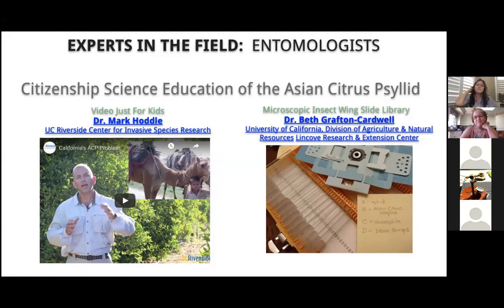I found the Foldscope by accident because I was looking for pictures of insect wings. I was writing some curriculum about the Asian citrus psyllid for a project I was working on a few years ago. And I came across the Foldscope website because people had posted various insect wing pictures. And then it just kind of snowballed from there. That's where I got the idea to use the wing of the psyllid.